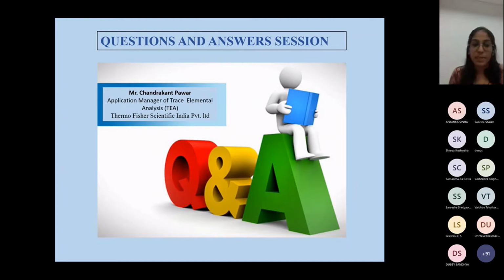That is a really good question, I missed that. Remember, friends, when you do the analysis, we don't know how much percent of carbon or nitrogen is present in my sample. But remember that this is a comparison technique, so always use a standard nearest to your values.